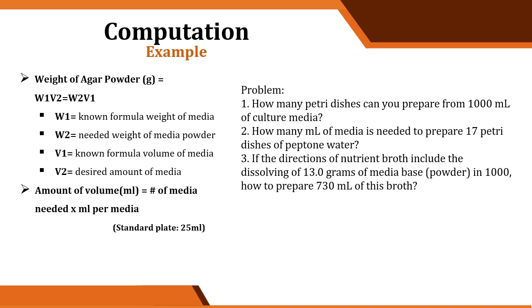Okay, so, read the following questions based on your understanding of how to compute the media based on the instruction provided by the manufacturer. Okay? So, for example, ang situation natin is, ang nakalagay sa ating directions is to suspend 28 grams of nutrient agar powder in 1,000 ml of distilled water.